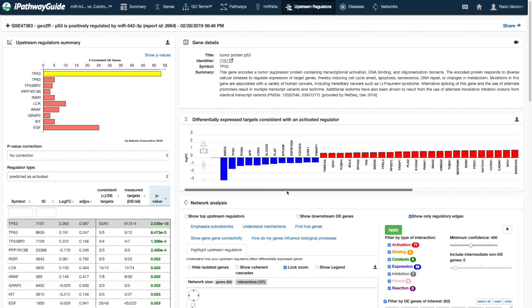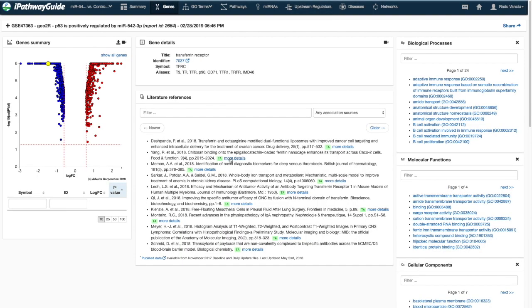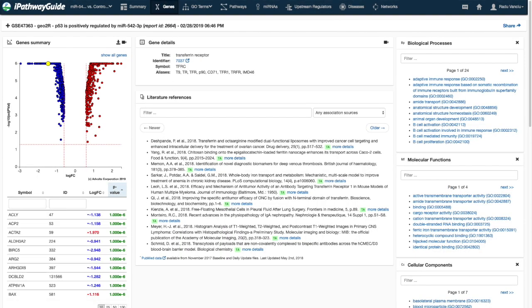Next to the fold change axis is a box plot showing the distribution of expression values for the differentially expressed target genes for that regulator. Clicking on any one of the genes will take you to the genes tab, providing more information about the selected gene.